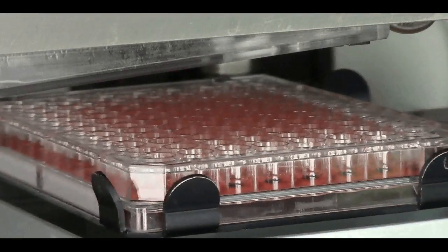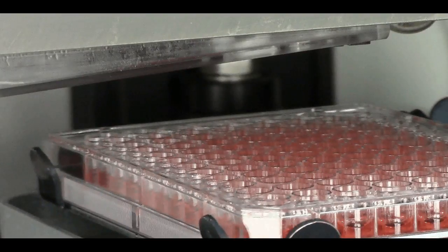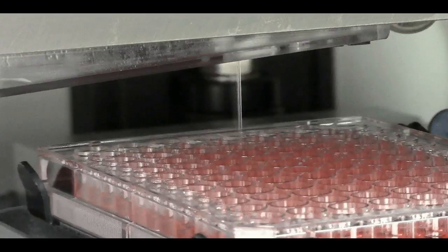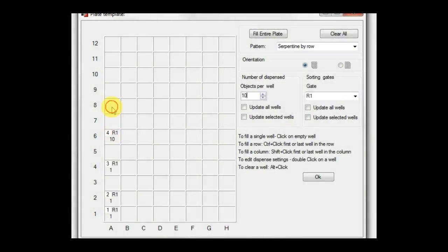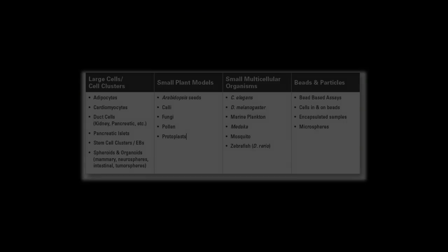Operating at lower flow rates and pressures, COPAS FP instruments produce less stress and potentially disruptive shear forces inherent in standard flow cytometers. Gentle handling means that objects remain intact and viable, with their morphology preserved for further experimentation. Objects can be dispensed to a multi-well plate, collection tube, or petri dish configured as a customizable output template. Objects not chosen for collection are sent to a recovery reservoir where they can be retrieved for further processing.